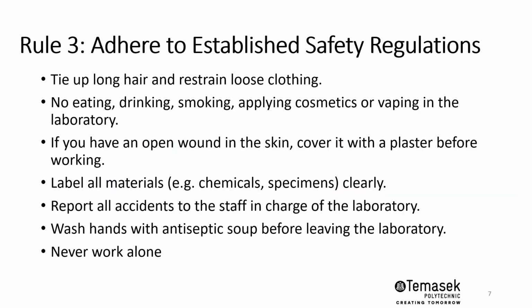Okay, rule number 3 is to adhere to all established safety regulations in the laboratory. You will want to tie up long hair if you have any, and restrain any loose clothing. For example, if you're wearing a tie, this should be taken off, just in case the hair or the tie get caught in the equipment.